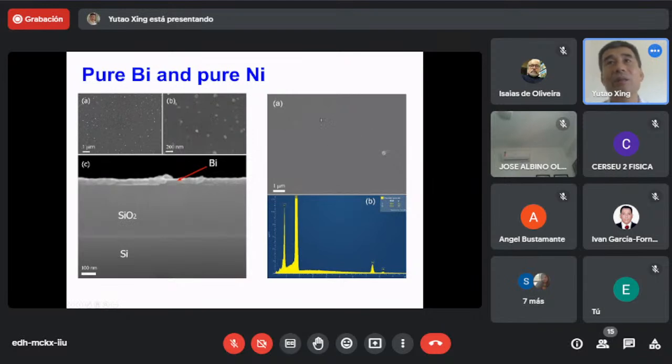And the nickel is completely flat. I show here a defect of the film only because I just want to show the focus of the image. Otherwise, we don't know if we focused on the surface or not, because it's very, very flat, very clean. So in fact, it was difficult to find this defect to show the surface.